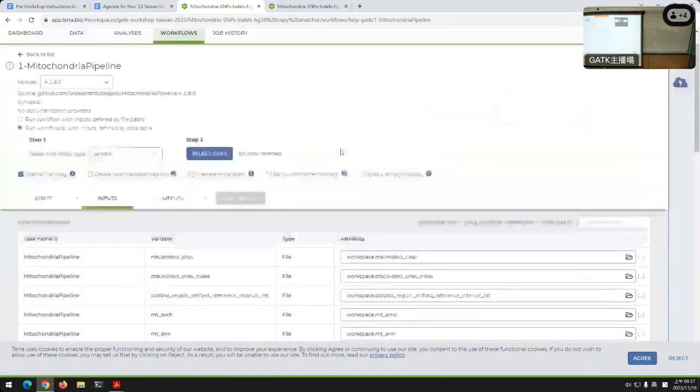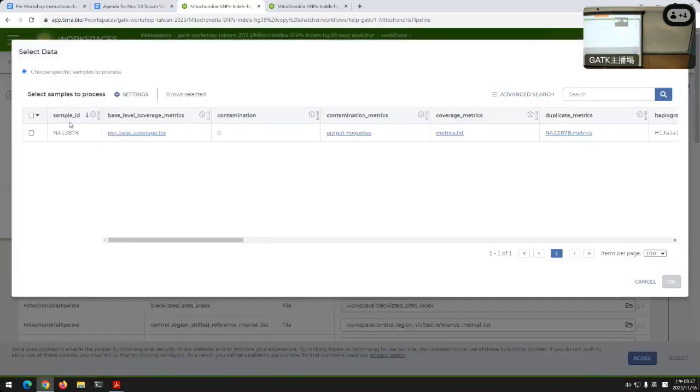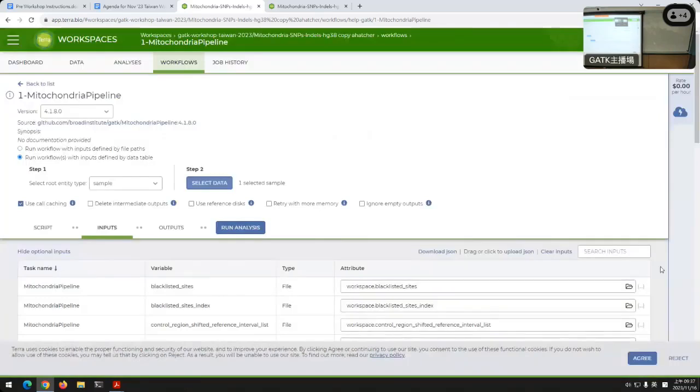But, I mean, instead of talking about it, let's just run it. I'll select data. We are, in fact, going to run this on our dearest friend, NA12878. Choose her sample as input. And now just click Run Analysis.